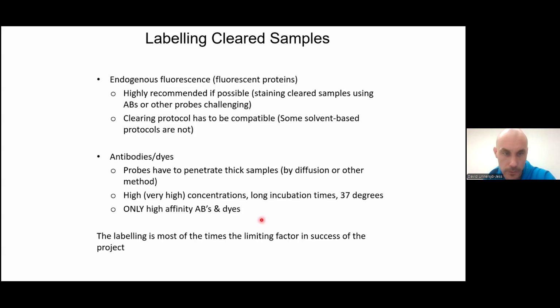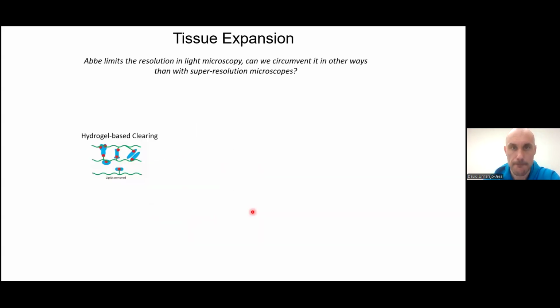So yeah, this is the step where you most of the time would fail, I would say, staining your samples. So that was everything about clearing.